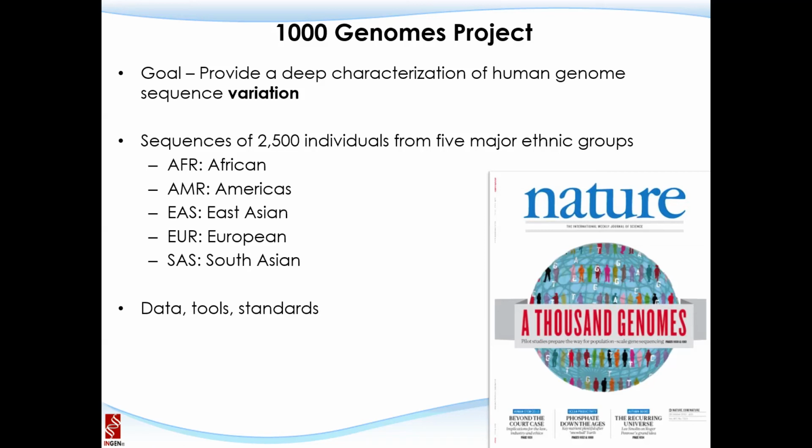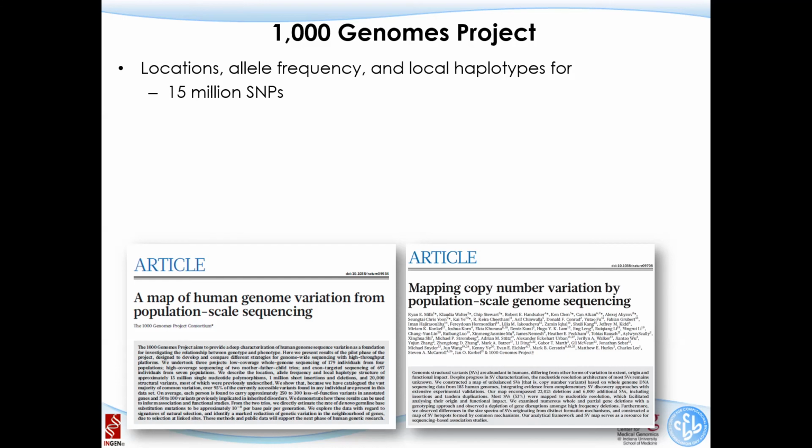The VCF file is there. We'll talk about what the VCF is, but the variant signal is here. The original files are there as well. Through this project, a lot of data was generated, and many tools were developed, like the GATK package that is our standard for DNA sequencing analysis. Many standards were generated in that consortium as well. So there's a huge impact for the scientific community.